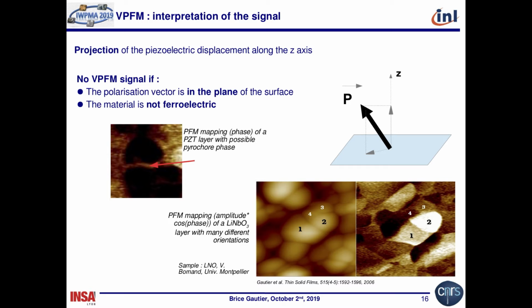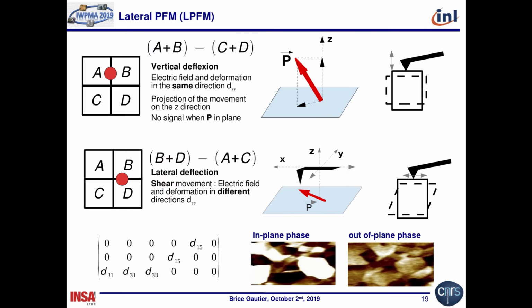But if you want to decide whether it is non-ferroelectric or in plane, you can change the tuning of the setup. You can turn to lateral PFM.